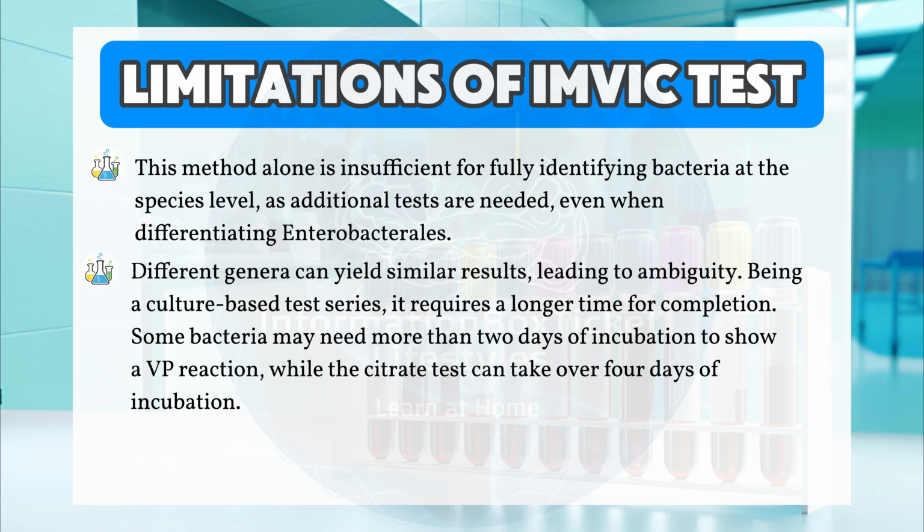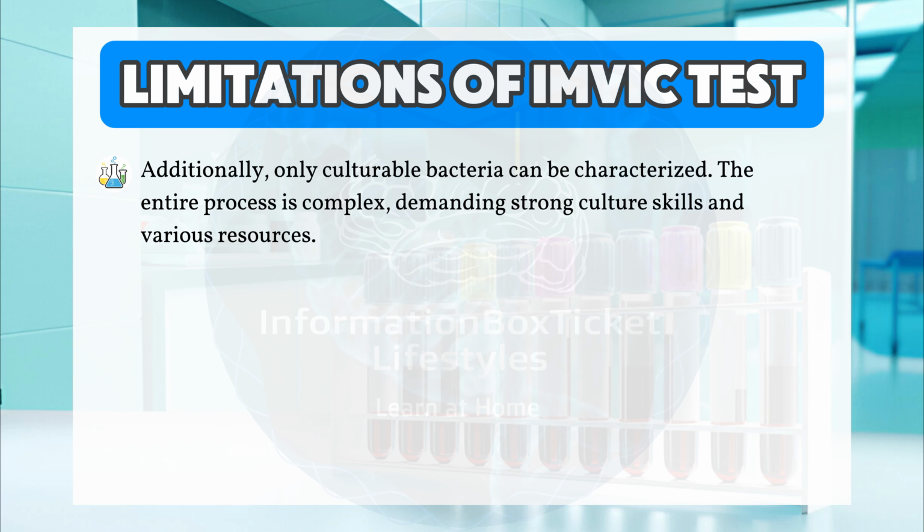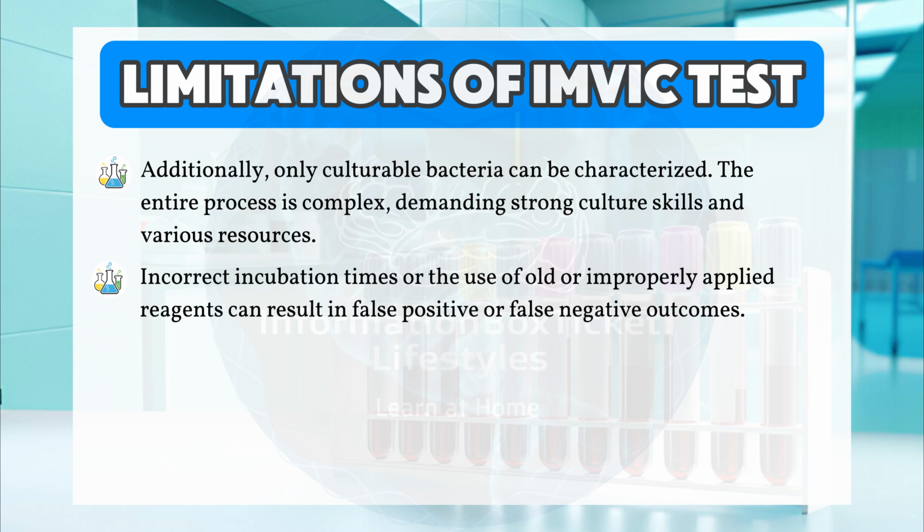Some bacteria may need more than 2 days of incubation to show a VP reaction, while the citrate test can take over 4 days of incubation. Additionally, only culturable bacteria can be characterized. The entire process is complex, demanding strong culture skills and various resources. Incorrect incubation times or the use of old or improperly applied reagents can result in false positive or false negative outcomes.